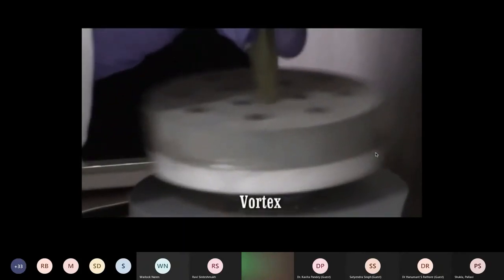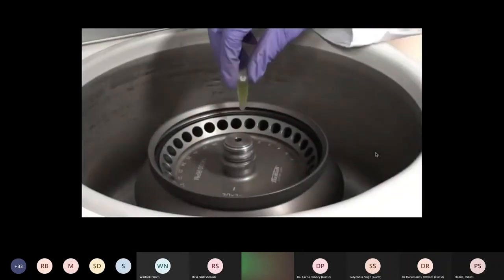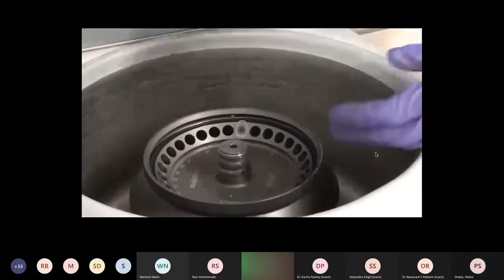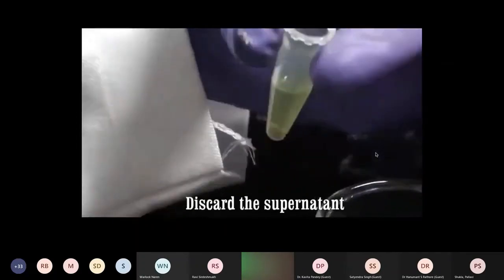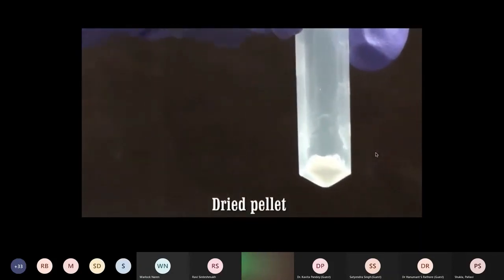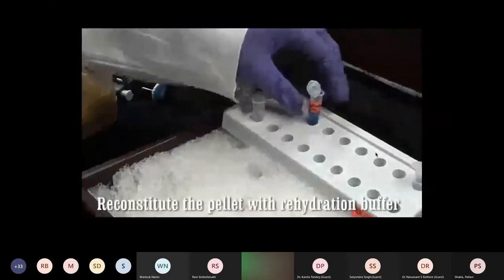Mix the sample well by vortexing to obtain a uniform solution. Centrifuge the contents at 4 degrees Celsius for 5 minutes at a speed of 10,000 rpm. Discard the supernatant and repeat the acetone washing at least 3 times to remove all plant pigments. Obtain the protein pellet at room temperature. Reconstitute this pellet with rehydration buffer.